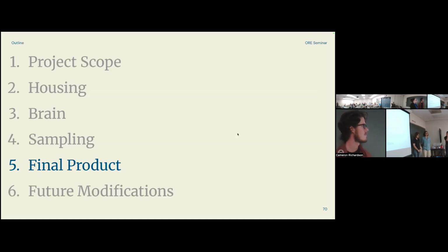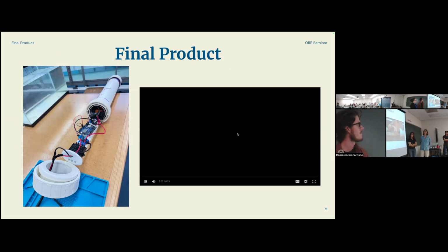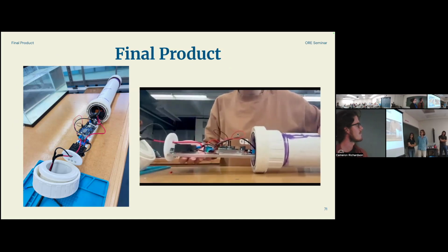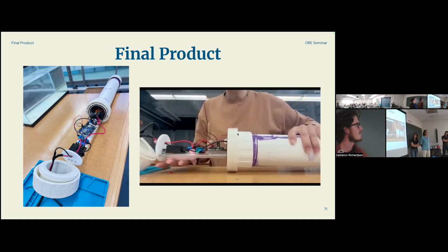So coming to our final product, now that we have the waterproofing done, we were able to put the sled into our housing and close it up with a union, which allows us to open and close it whenever we want to. And yeah, you can see a video here of the lady placing the sled in.